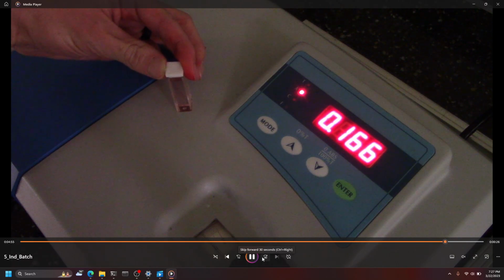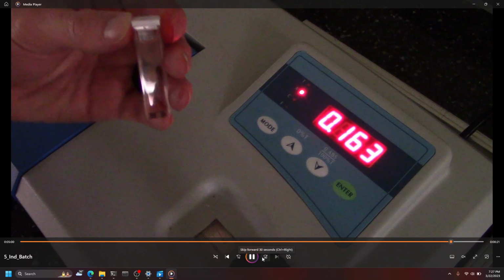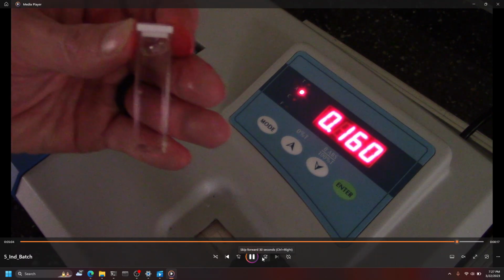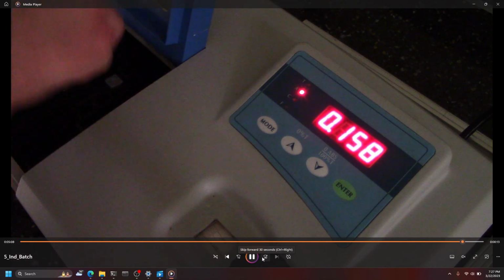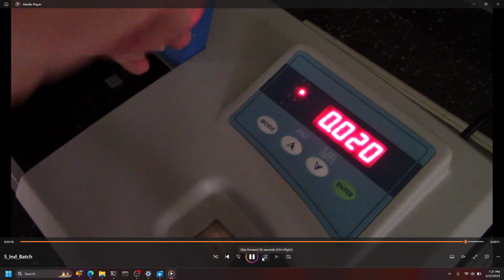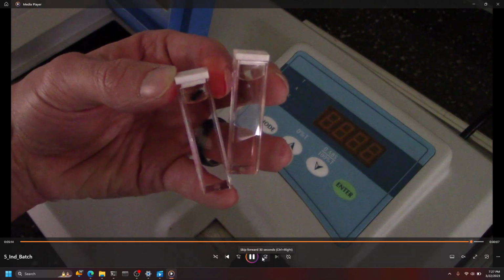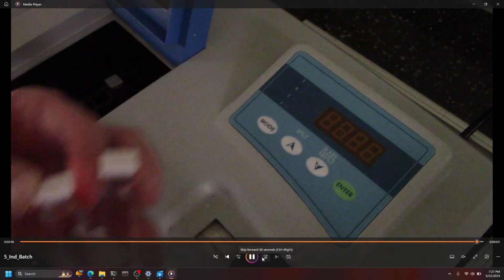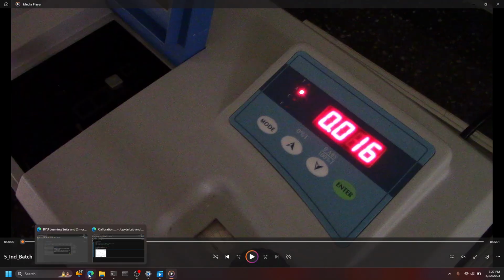And here in just a second, I'll pull the other one out and I'll turn off that light to then show how the red dye is totally dissolved in the sodium hypochlorite. So as you look at both of them here, you can see that they both look pretty clear, and as we turn off the red light, you can see that the red dye has completely dissolved within the sodium hypochlorite.